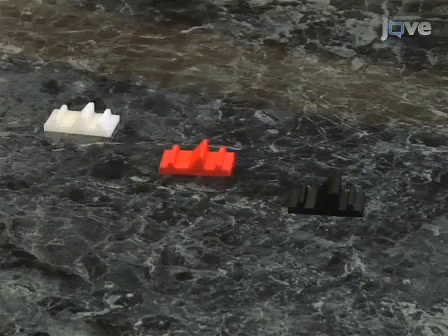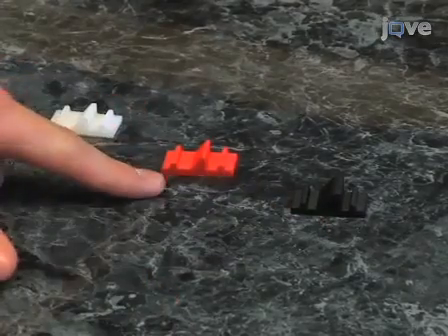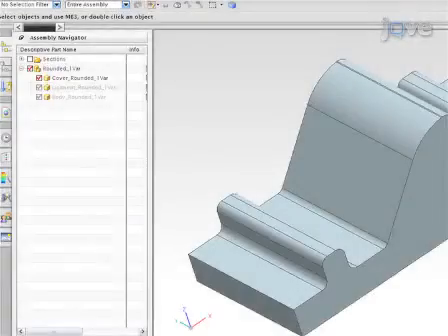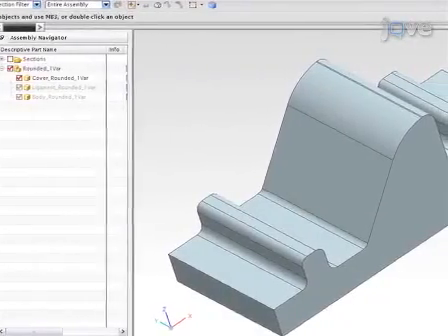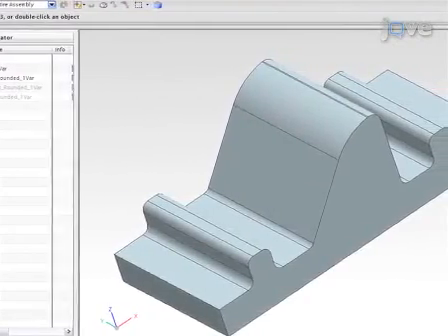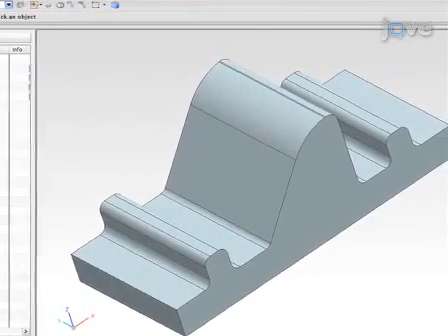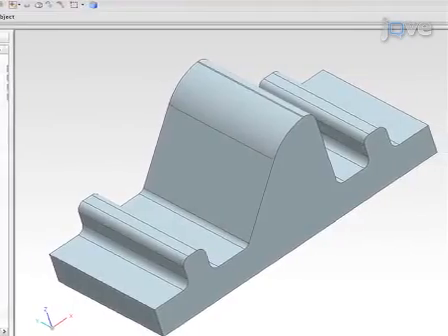First, create solid models of three vocal fold layers: the superficial lamina propria, ligament, and body layers. This is typically done by creating 3D computer-aided design models with the desired geometries, exporting the CAD models as stereolithography files, and sending the STL files to a custom machine shop for rapid prototyping.